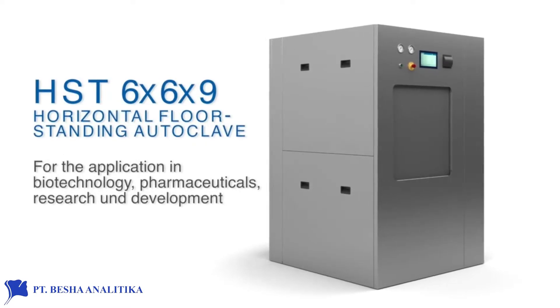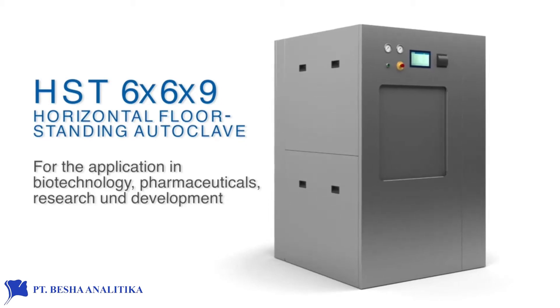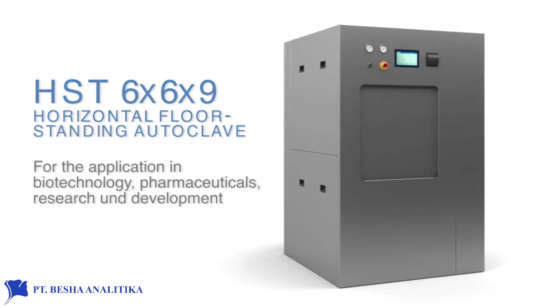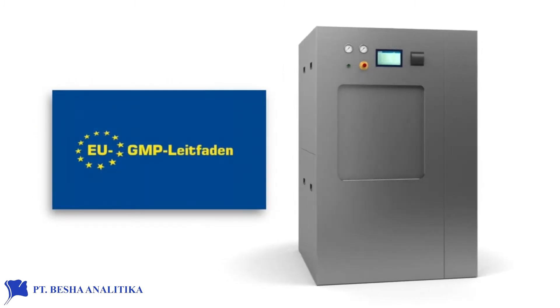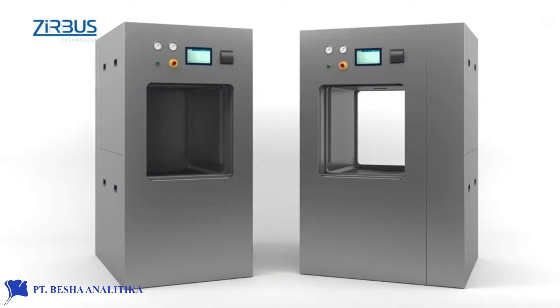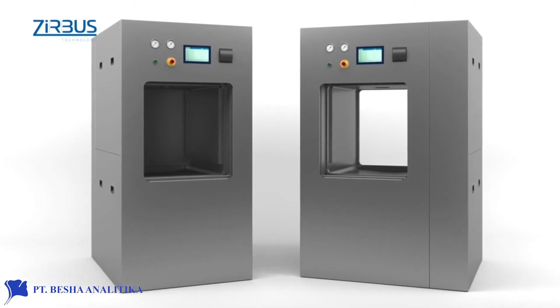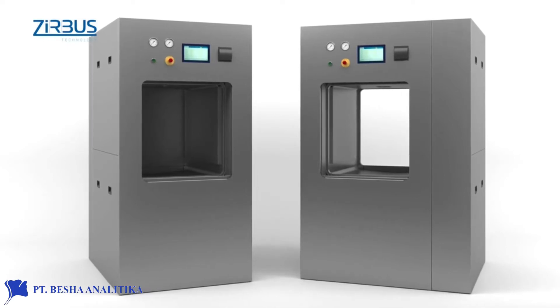The HST 669 horizontal floor standing autoclave is a sterilizer for use in biotechnology, pharmaceuticals, and research and development. GMP compliant qualification is available upon request for the optional GMP version. Like all floor standing autoclaves from ZIRBUS, the HST 669 is available in either a single door version or as a pass-through model, including wall installation with a bio-seal barrier.